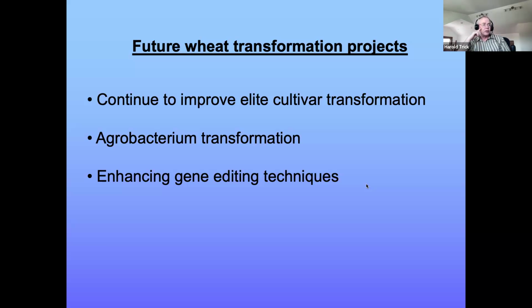With these, what we typically do is we will send DNA to the provider, and then they can pre-screen those plants to see whether or not they had the edits in there. That may help with sending the seeds back to the PI. Okay, so I'd like to end it there.